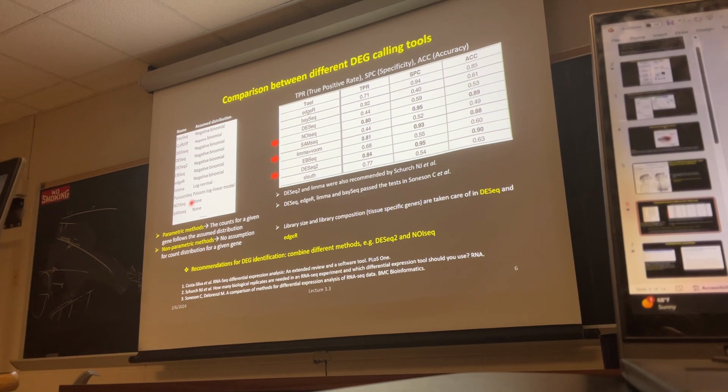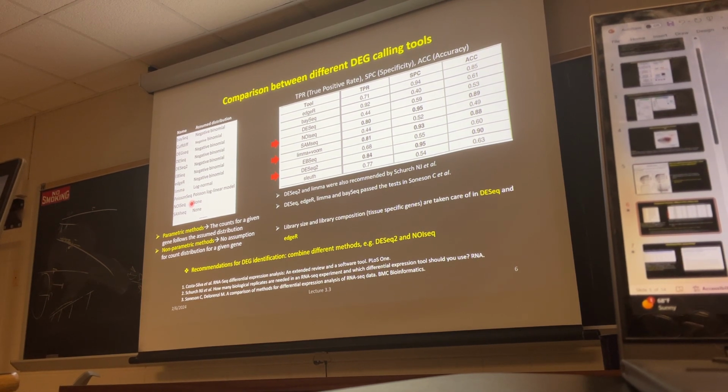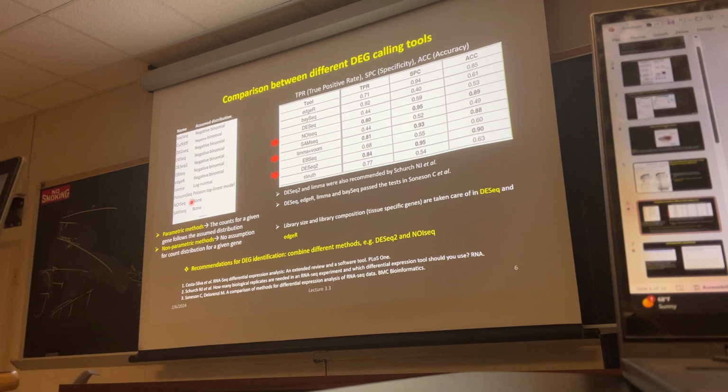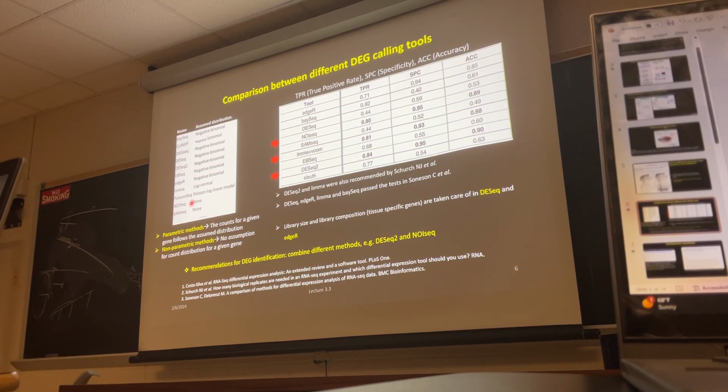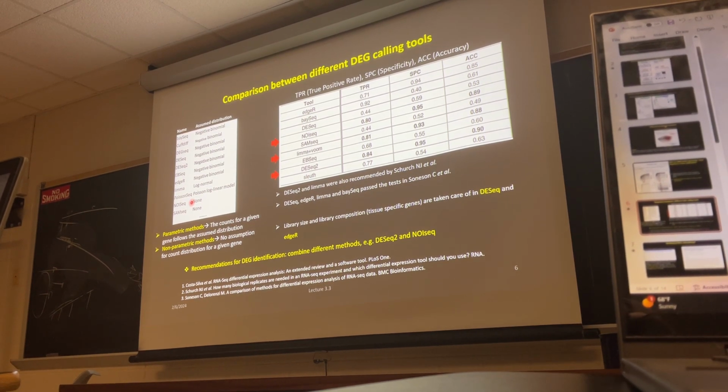And then it will find some type of factor, which is basically a number. That number will then be used to normalize each gene. Basically, DESeq2 normalizes each gene per sample. So this gene is normalized across the samples, the second gene is normalized across all the samples, and so on and so forth. So this is the different type of normalization that DESeq2 offers.